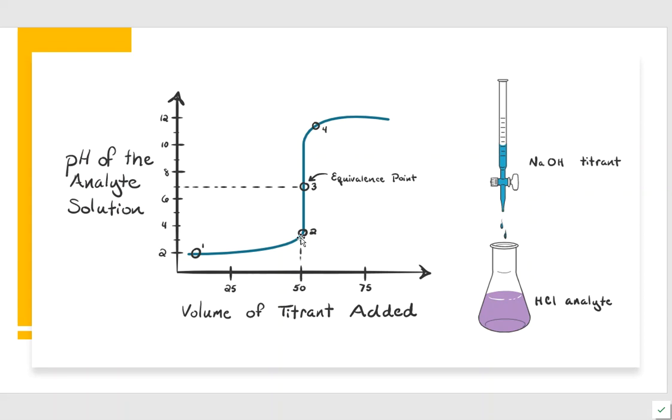So at 50 milliliters, whoosh, there goes the S shape of the titration curve. It skyrockets at this point, and that is the area where my equivalence point is going to be. Halfway there, I come over, and I see a pH of around 7. After the equivalence point, I now have nothing but extra base, and now we're on the pH side of the house that is basic. Here are my pHs of 10s, 11s, and 12s. So folks, there is your typical titration curve.